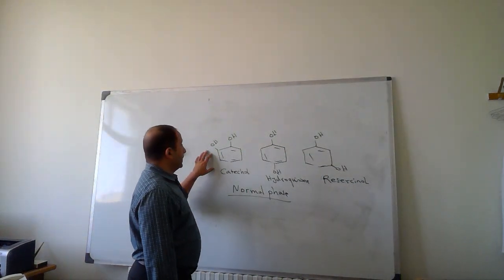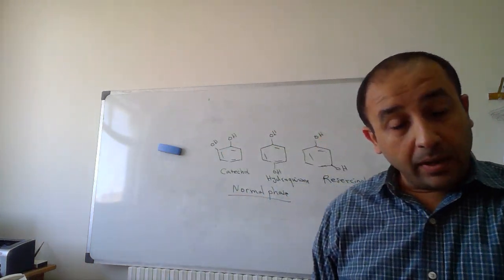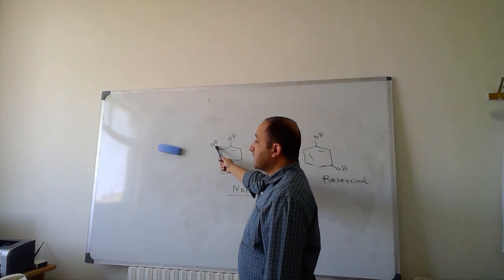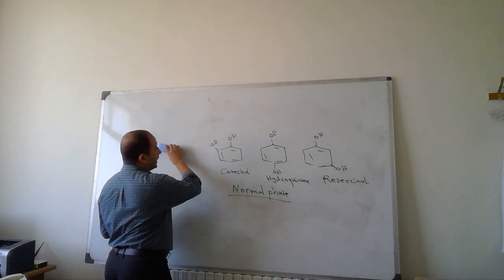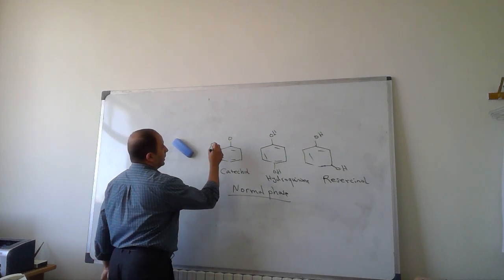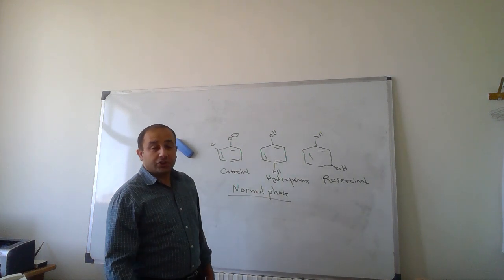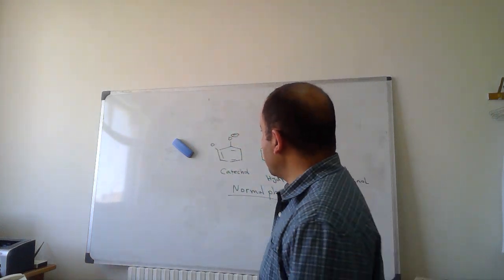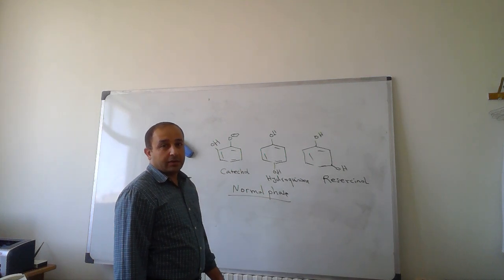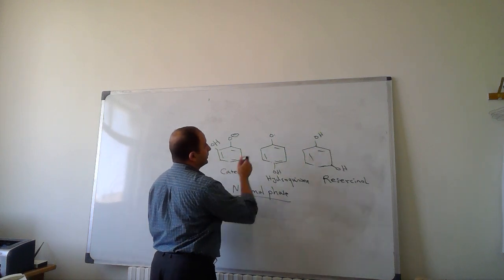For example, with this kind of phenols, if we increase the pH of the mobile phase above 10, then these compounds can take ions. The problem in chemistry is that the first ionization is much stronger than the second ionization. So at a pH just above 10, like 11, we might only ionize one of the hydroxyls.